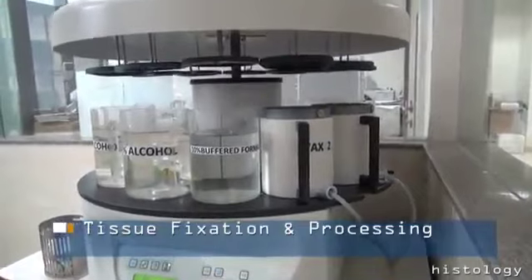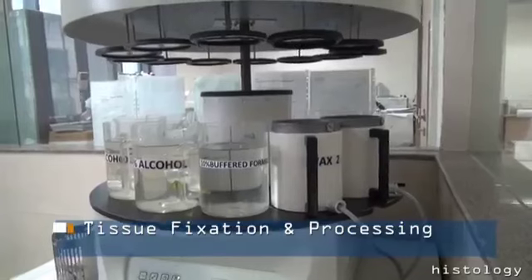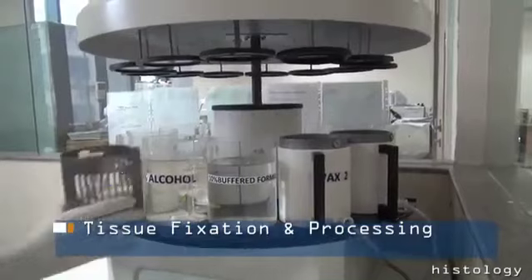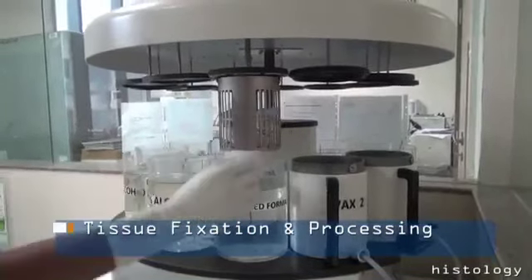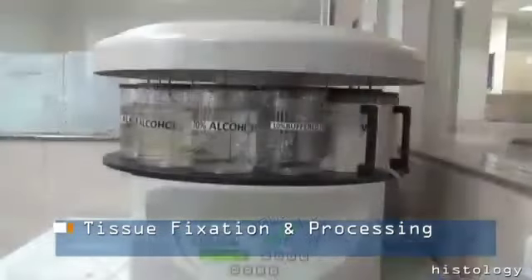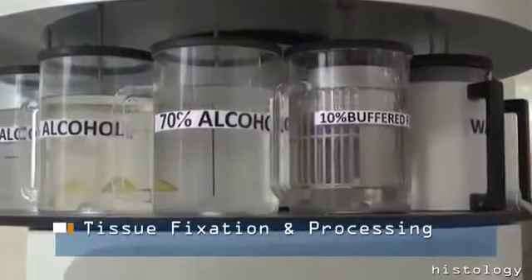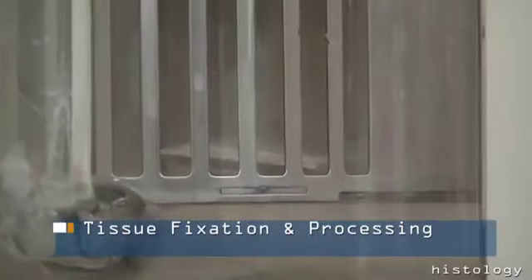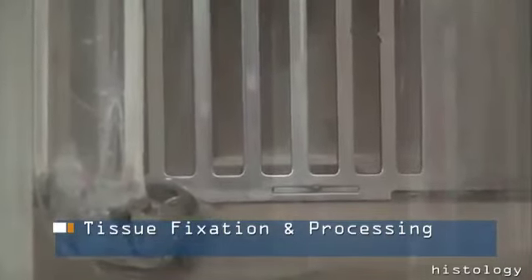Tissue fixation and processing. An essential part of all histological and cytological techniques is preservation of cells and tissues as they naturally occur. Hence the objective of tissue processing is to stabilize the tissues or cells and preserve their morphological, anatomical and biochemical characteristics for accurate diagnosis. To accomplish this, tissue blocks, sections or smears are usually immersed in fixative solutions. The most commonly used fixative is 10% neutral buffered formalin.